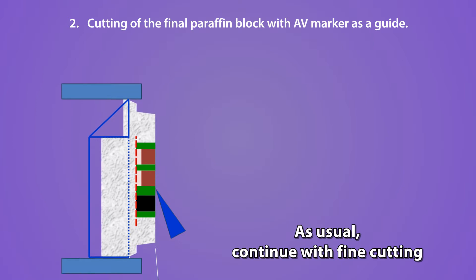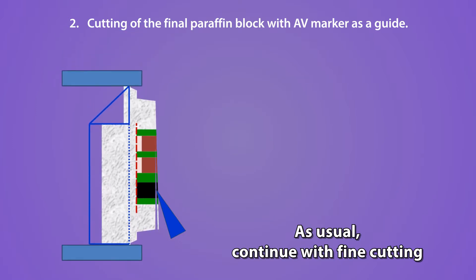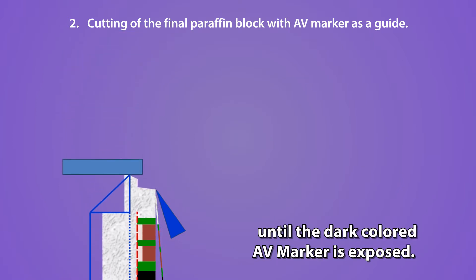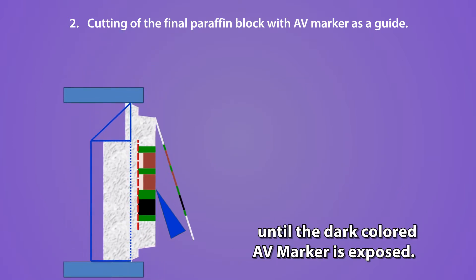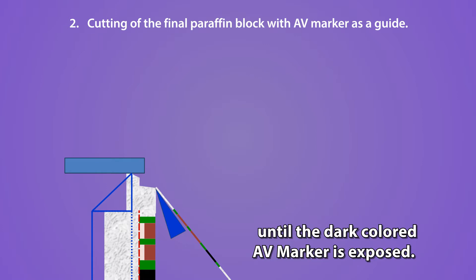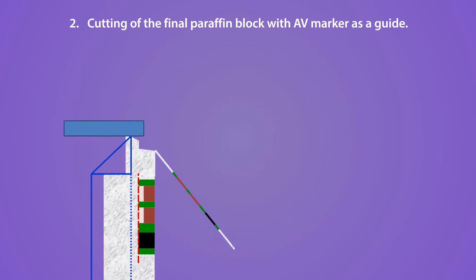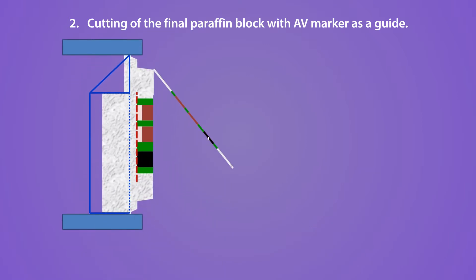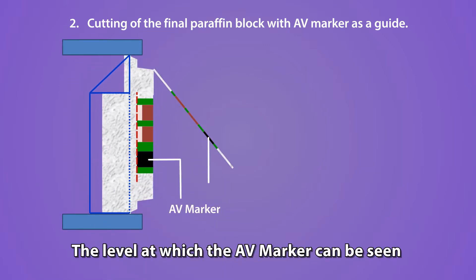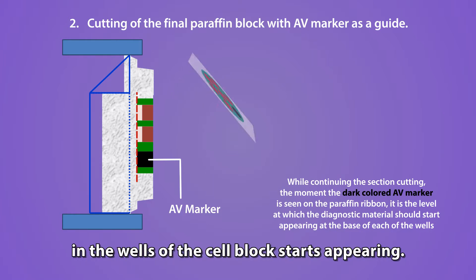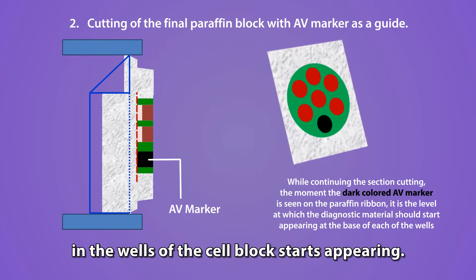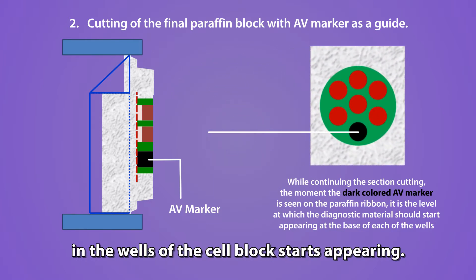As usual, continue with fine cutting until the dark-colored AV marker is exposed. The level at which the AV marker can be seen is the level where the diagnostic material in the wells of the cell block starts appearing.